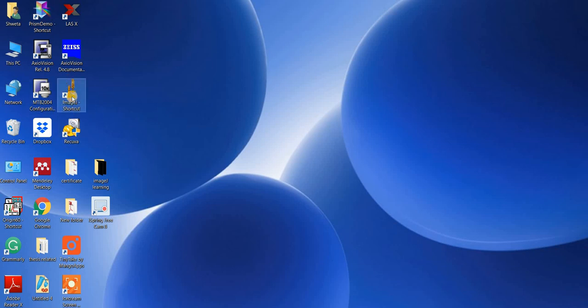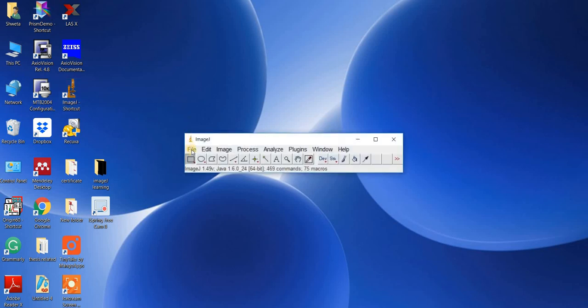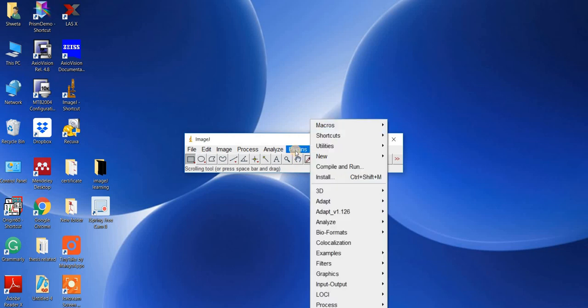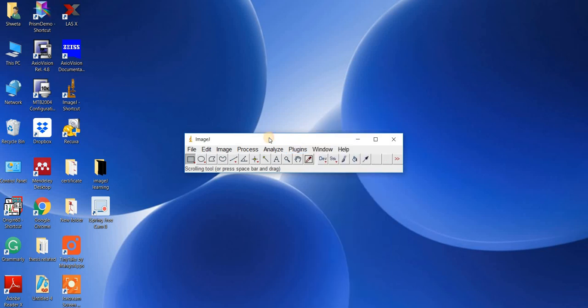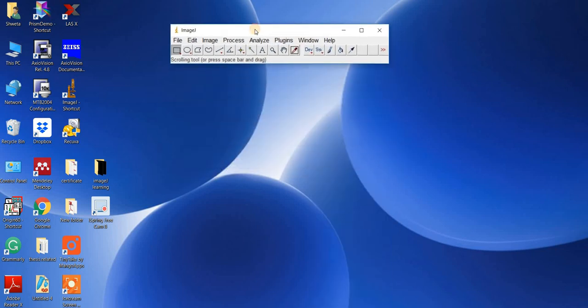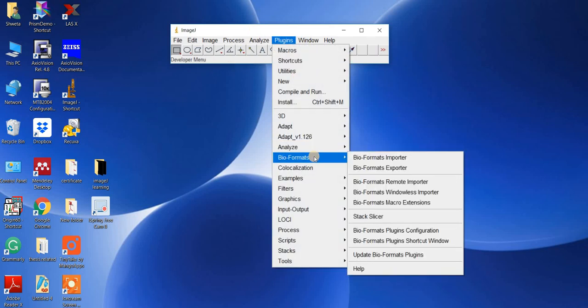Now I'll show you the ImageJ software. The icon looks like this, and when you double-click it you get options: File, Edit, Image, Process, Analyze, Plugins, Windows, and Help. One of the most important things is Plugins. There are different plugins available on the same NIH site. For analyzing your confocal images, you need to install a plugin called Bio-Formats — it's very important. After downloading, install it in the plugin folder.